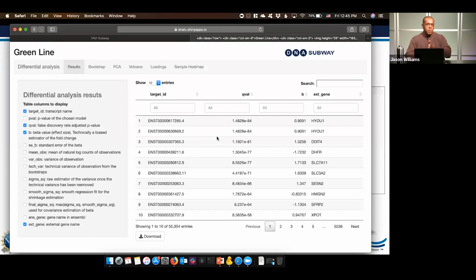and then graduate users to using Kallisto and Sleuth, perhaps in the discovery environment, which I'll show you in a minute, or in a Jupyter or RStudio notebook. I'm going to show you those in a moment.